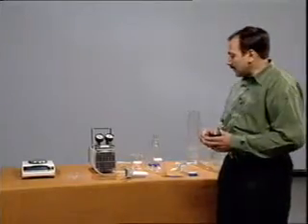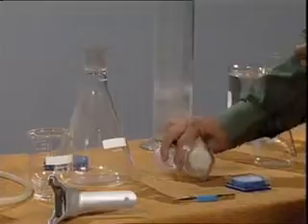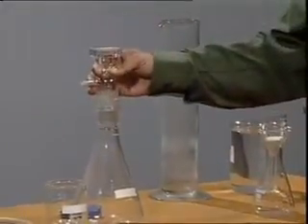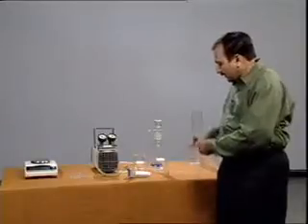First, we shall put different components of the assembly together. Take the glass base, place it on the flask. Now, we shall take a filter out.